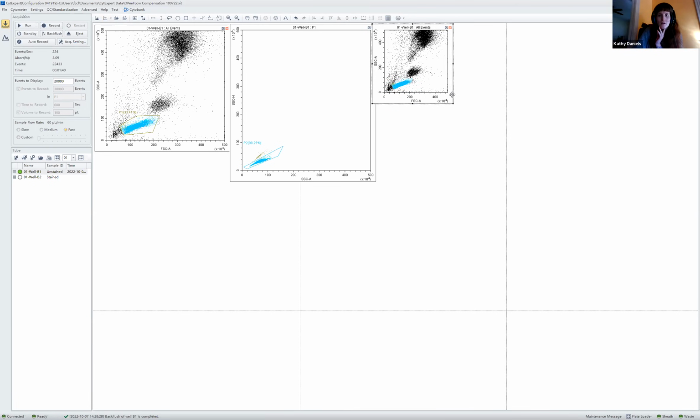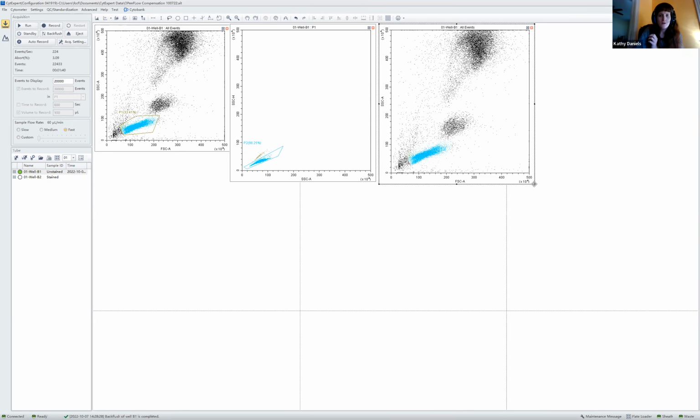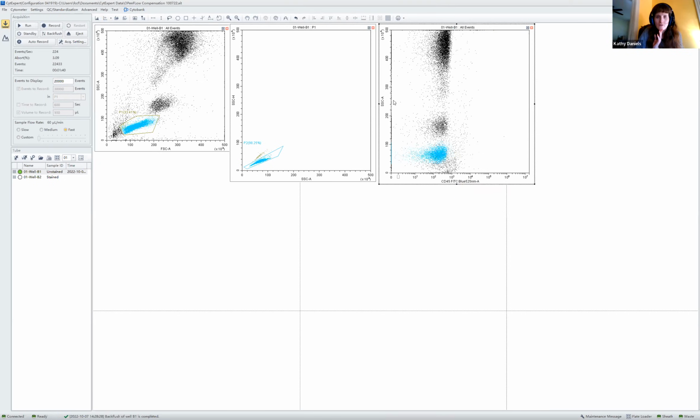Yep, absolutely. Okay. So then this sample was all done in terms of recording. So then what I'm going to do is continue on with this basic gating strategy. So next I'm going to choose CD45, and actually I'm going to do CD45 and I'll do CD3. And I'm going to select where it says all events. And now I'm going to show P2 because that's my singlet gate.